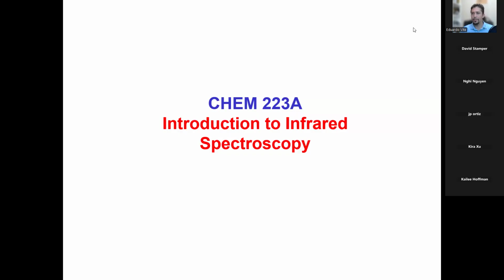We're gonna go ahead and talk today about the details of infrared spectroscopy. So your pre-lab quiz question was, what does IR stand for? It's infrared spectroscopy. Specifically, IR means infrared. We usually say IR to mean the whole spectroscopy, but really it's just infrared, but it's IR spectroscopy, or you can just say IR. So you'll hear people say, we did IR on the molecule. That means we did an infrared spectroscopy analysis. So infrared spectroscopy.